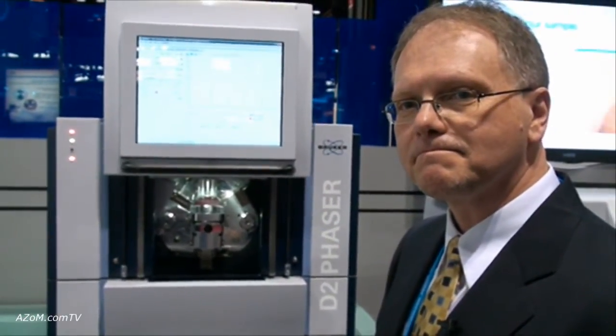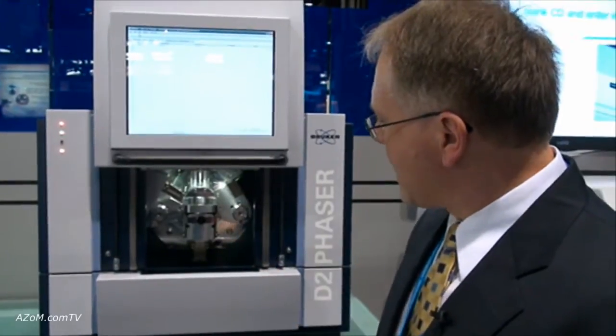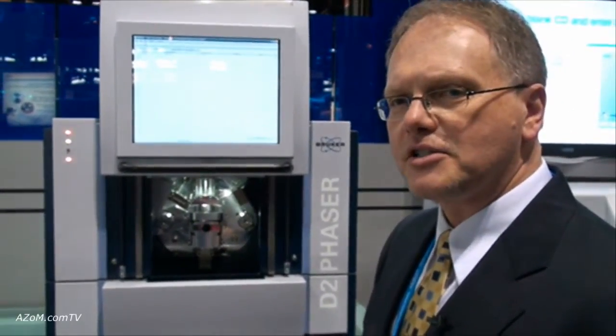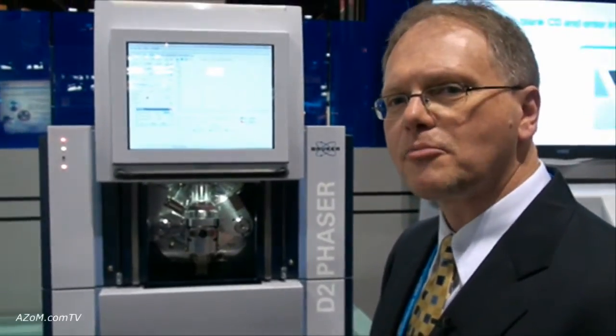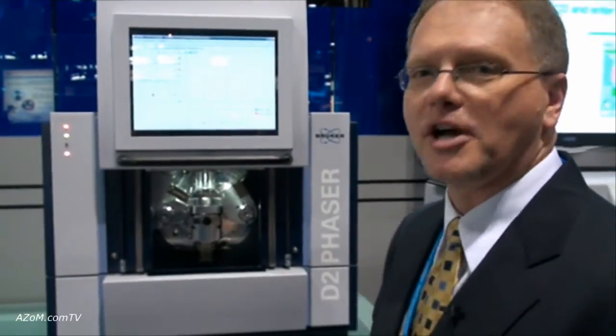And how is the resolution on this device compared to other floor-standing, free-standing type XRD? That's a great question. The peak accuracy is 0.02 degrees — on our high-end research instruments it's 0.01 degrees. This is getting as close as we possibly can to our high-end research system in a benchtop model.